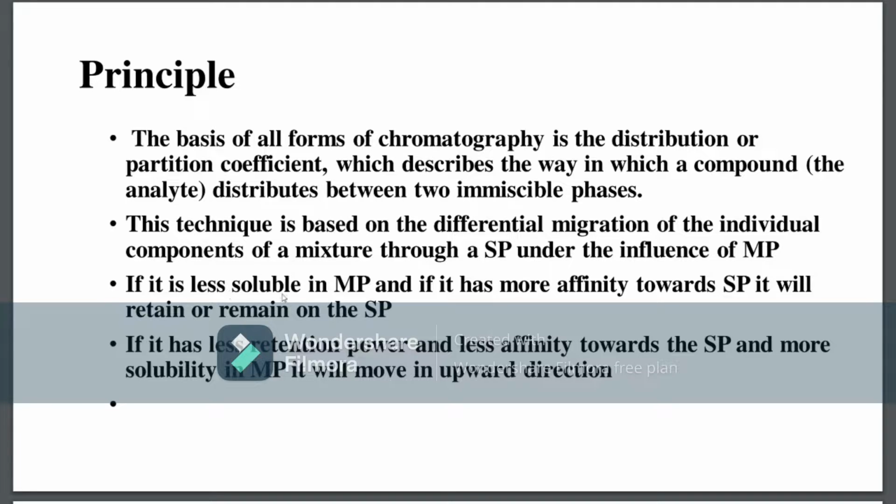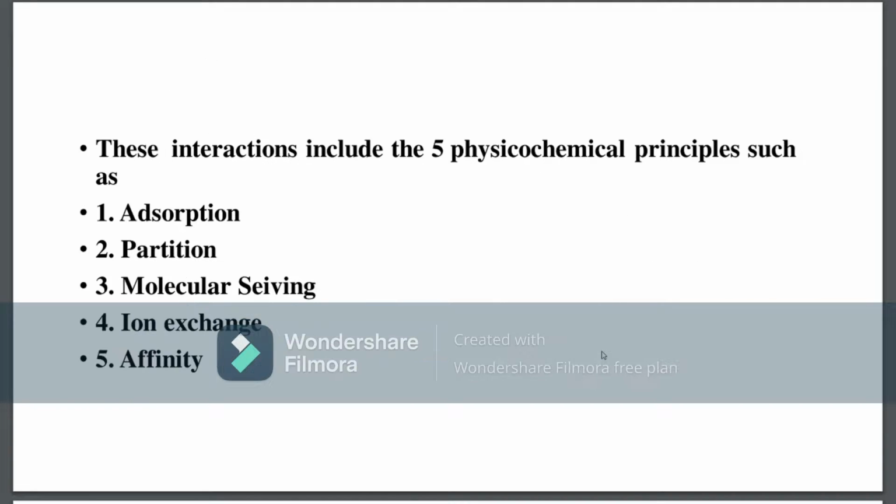If a compound is less soluble in the mobile phase and has more affinity towards the stationary phase, it will be retained, or remain, on the stationary phase. If it has less retention power, less affinity towards the stationary phase and more solubility in the mobile phase, it will move in the upward direction.